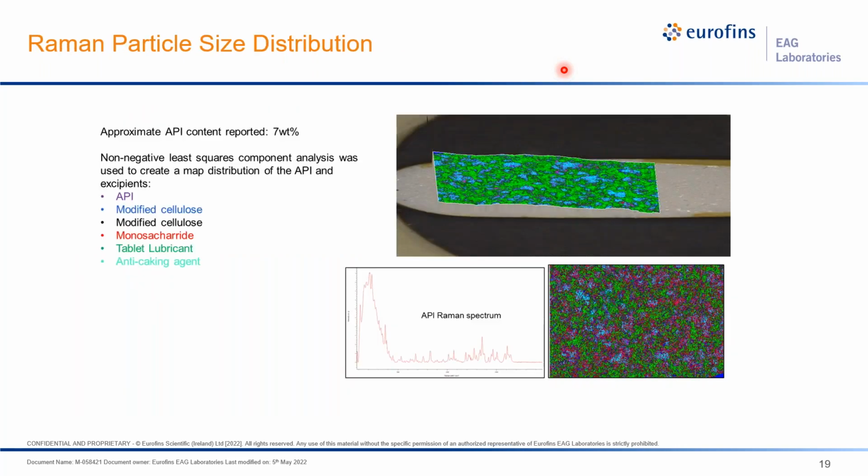So when it comes to the Raman particle sizing, we've actually purchased and obtained several new instruments in the past couple of years through the support of Eurofins, and we're able to do some really cool stuff now that we weren't able to do in the past. One of those is this API particle sizing.